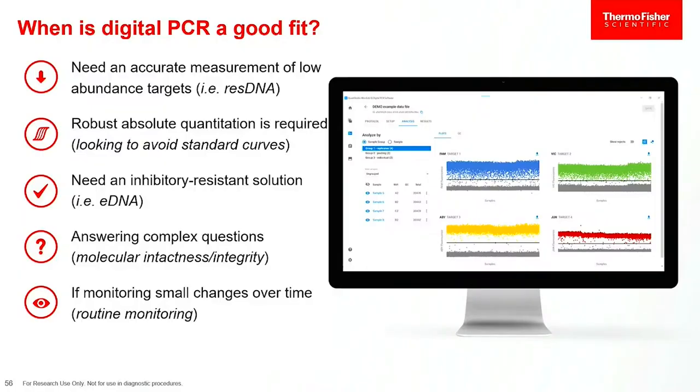Another good point to use digital is that there is a technological limit to qPCR, especially in gene expression. The example I gave you was anywhere from 0.25-fold to 256-fold. That limit in qPCR is about twofold. Anything less than about 1.5 or twofold difference, and it's not that we don't make good instruments, it's just across the board, everybody's technology.